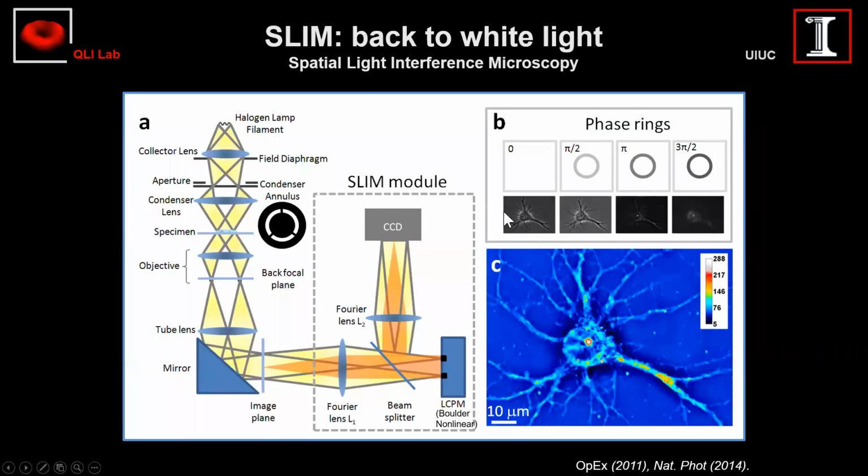So with these 4 frames now, I am able to decouple all those unknowns uniquely. So I combine them in a very easy way, and I get a quantitative phase map that is now free of the amplitudes and all the other unknowns. So the important thing I kept telling you about the common path, if you look here, there is no second arm that goes somewhere else, like in a Michelson interferometer. What interferes here is this light that is focused here on the ring, and the light that is spread outside the ring.